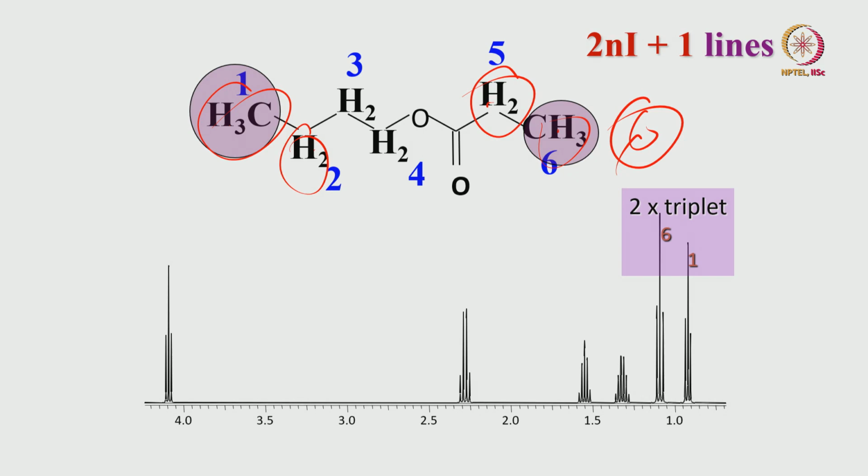As I already told you, you have to look at the separation of this J coupling and match it with the other one to which it is coupled. You can extract that information. Easy to analyze. Let us say both of them have equal J coupling. Still, if you want to know which is which, there are ways to analyze. When you go ahead further, we can find out by using COSY and other 2-dimensional techniques. But we do not have to go to that. This is a fairly simple molecule, so straight away we can get this information.